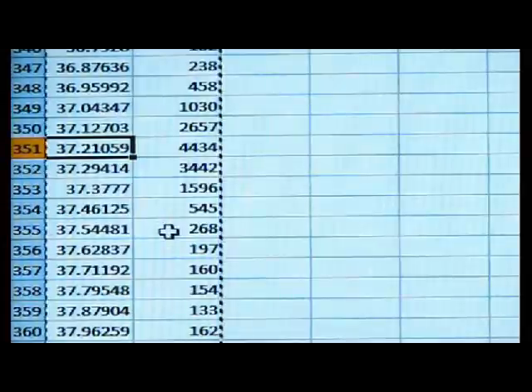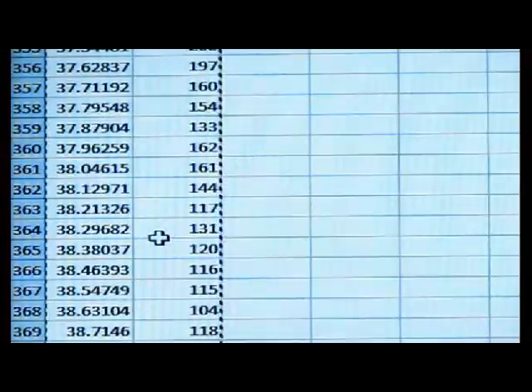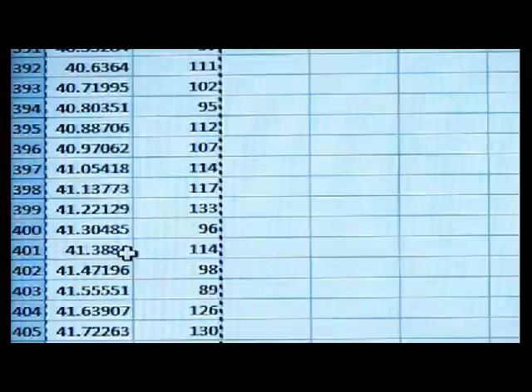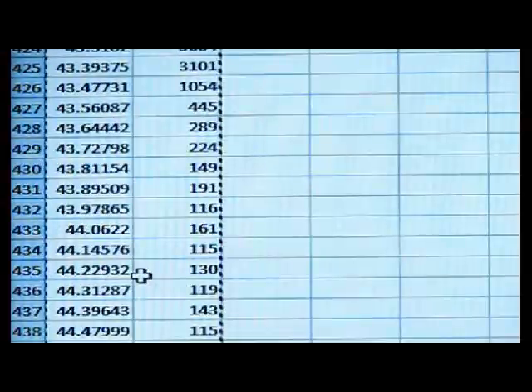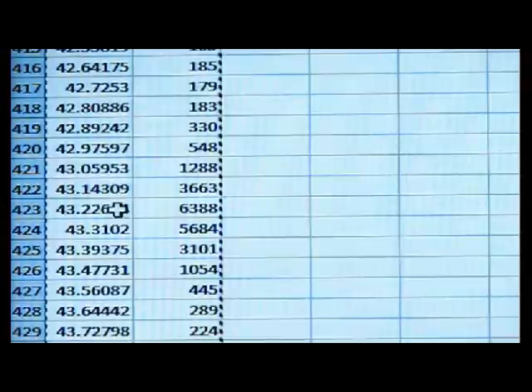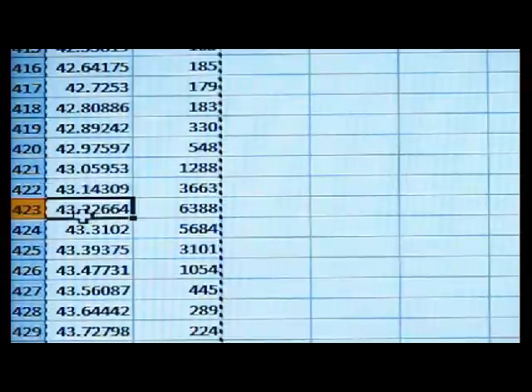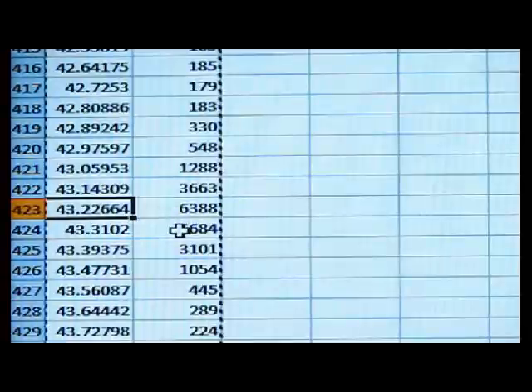Now we go to the second peak, that is 43.25. Here, 43.22664 got the maximum intensity, that is 6388. So this is the second peak.